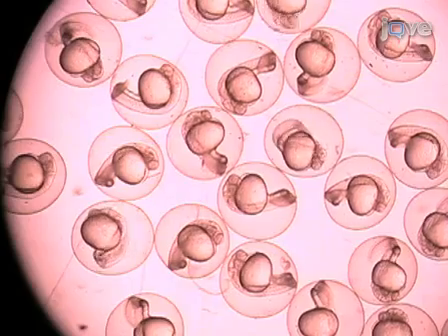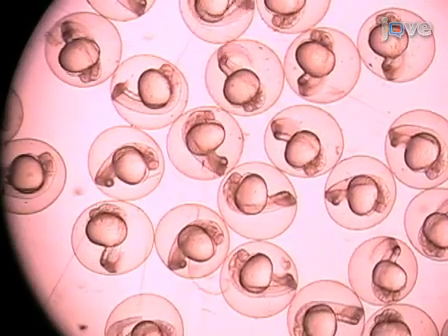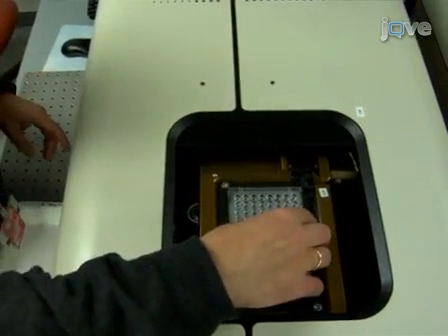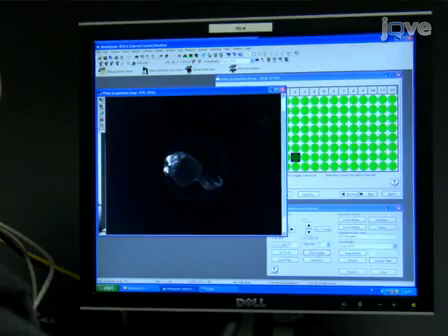Today we will show you the procedure for breeding, selecting, and arraying zebrafish embryos for chemical treatment in a 96-well plate. We will use transgenic embryos that report on fibroblast growth factor activities and treat them with a molecule that hyperactivates this pathway. We will show you how we use high-content screening methodology to automatically acquire, analyze, and quantify fibroblast growth factor activity in transgenic zebrafish embryos. This procedure will highlight platform technology to utilize transgenic zebrafish in high-throughput chemical screens. So let's get started.